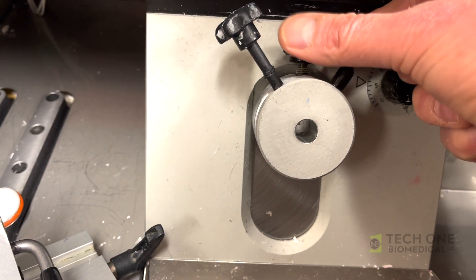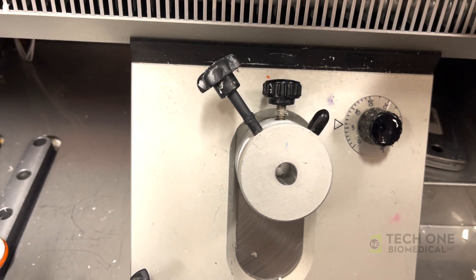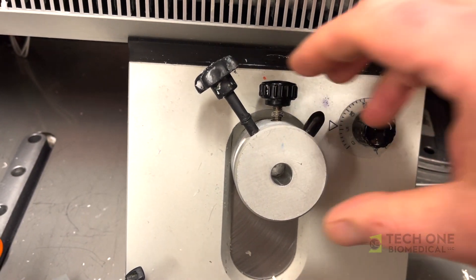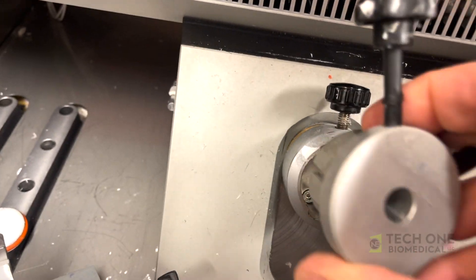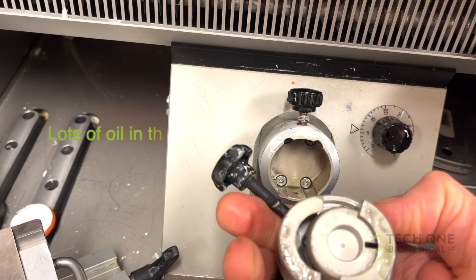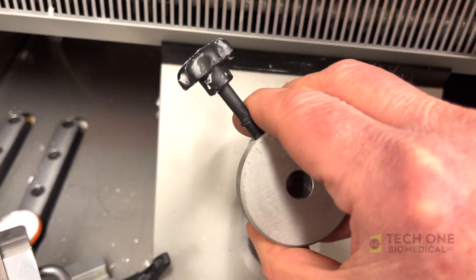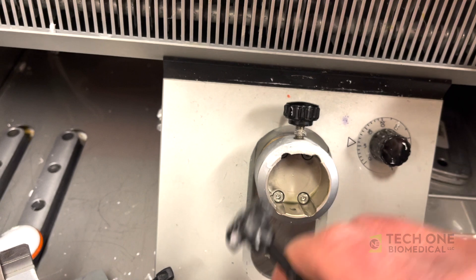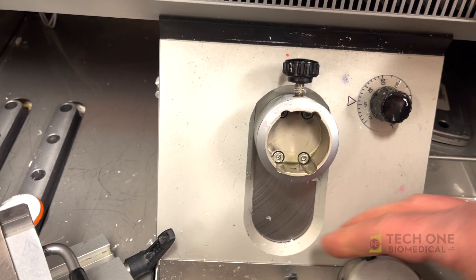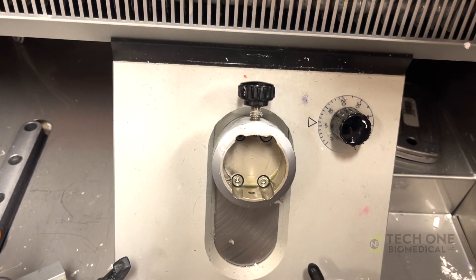The second reason is the lab bought some cryostat oil from a manufacturer and has continued to put oil in here. On this part — I've removed the screws so it's removable, it's not normally easily removable — but the oil is not allowing the proper amount of friction to be exerted on the clamp that holds the orientation in place.